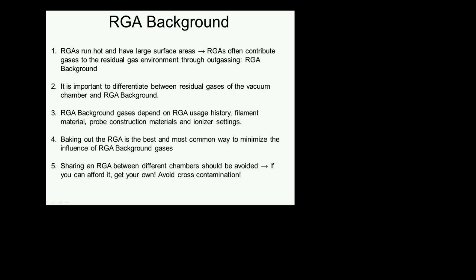So the first thing, somebody left a question, I don't remember if it was he or she. They were saying, I have an RGA in an ultra-high vacuum system. We routinely pump down to 5e-11 torr. We bake out the RGA. I turn on the RGA, and I still see outgassing from it. It's just not going away. We're going to be talking about that. So this is why you're still seeing stuff in your system.